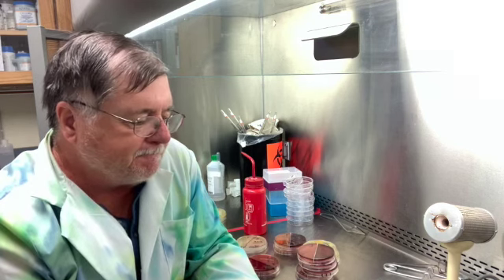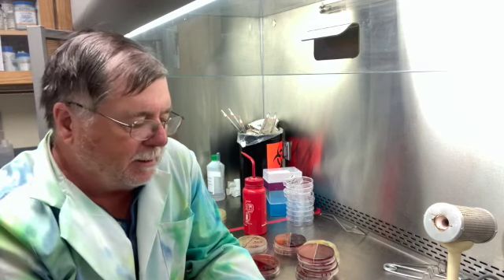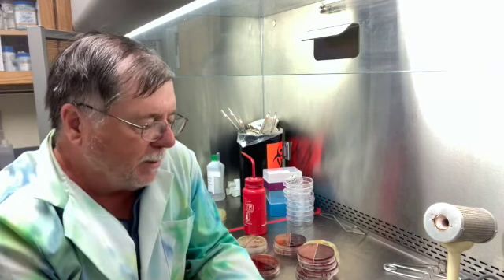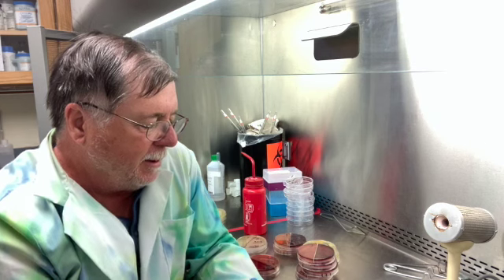So that is a good media to choose when you're working with a coliform. And if you don't know what it is, it's one of the first ones they will streak out when they're working with unknown bacteria and they want to know if it's a coliform. So they might do this for a urinary tract infection.